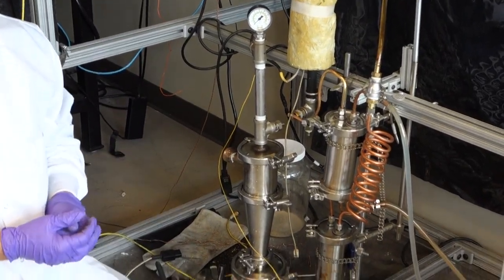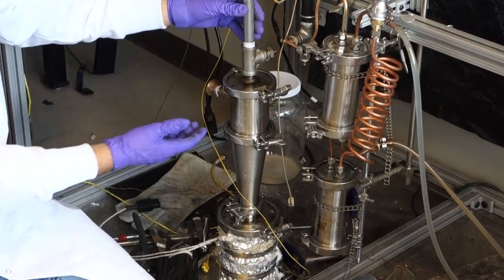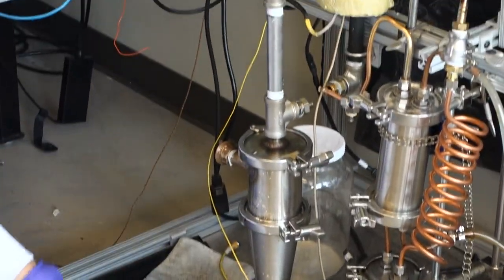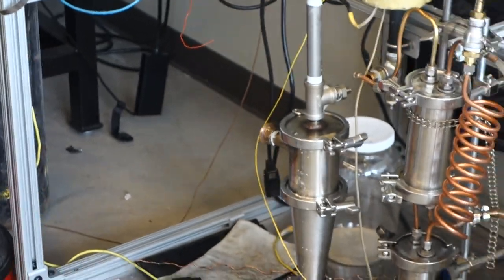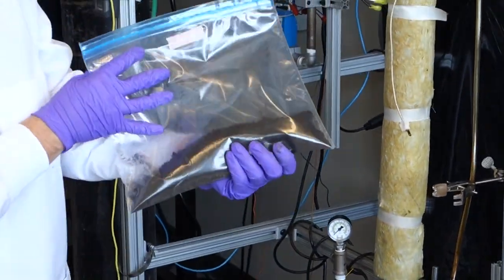This is a cyclone unit, which separates all of the biochar. This black material here looks a lot like charcoal.